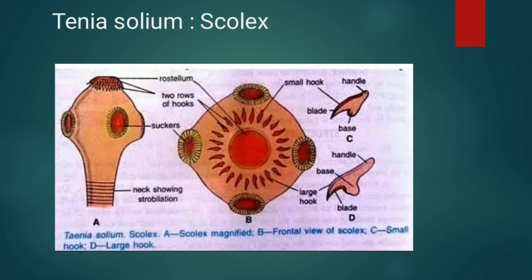The proximal part has four adhesive suckers, and the distal part contains a small refractile prominence in the middle known as the rostellum. The rostellum has a double circle of hooks, about 28 to 32 in number. Smaller hooks alternate with large hooks, measuring 110 to 140 and 160 to 180 microns respectively. Internally, the scolex contains spongy mesenchyme with a nephridial network and nerve ring.